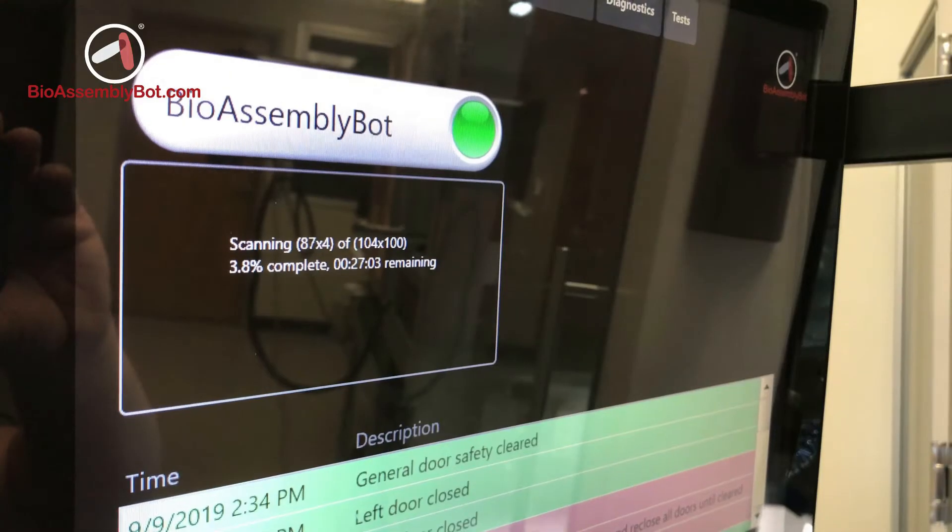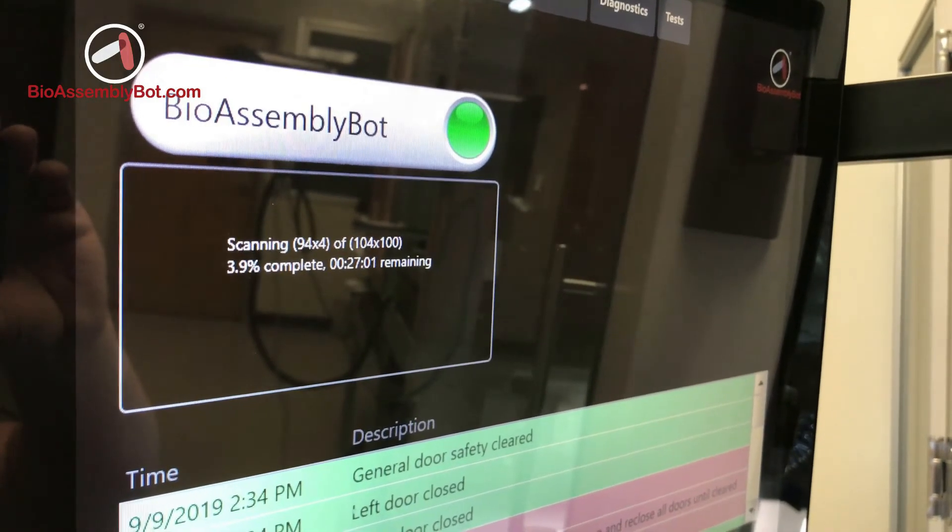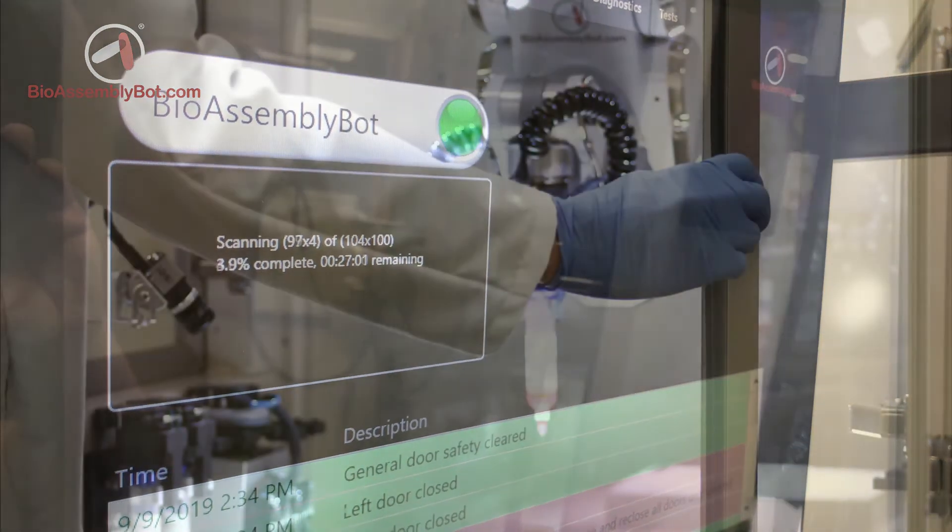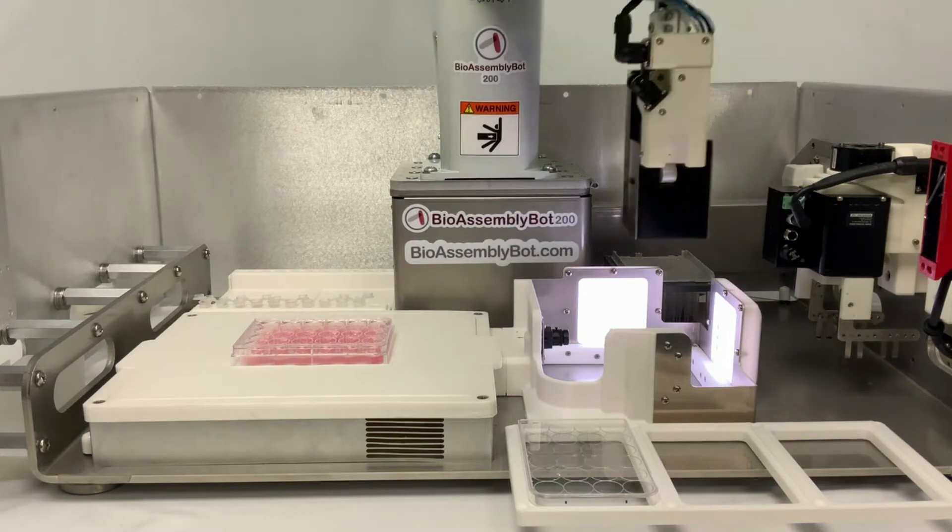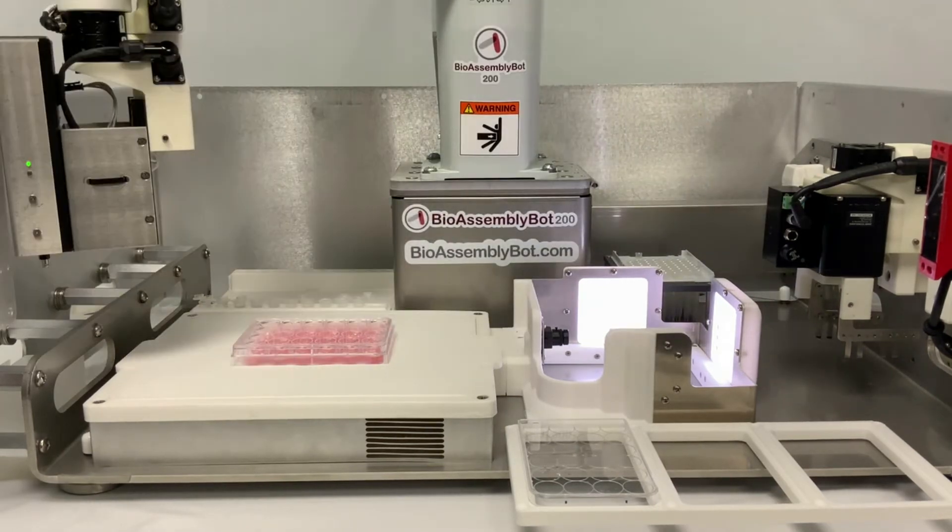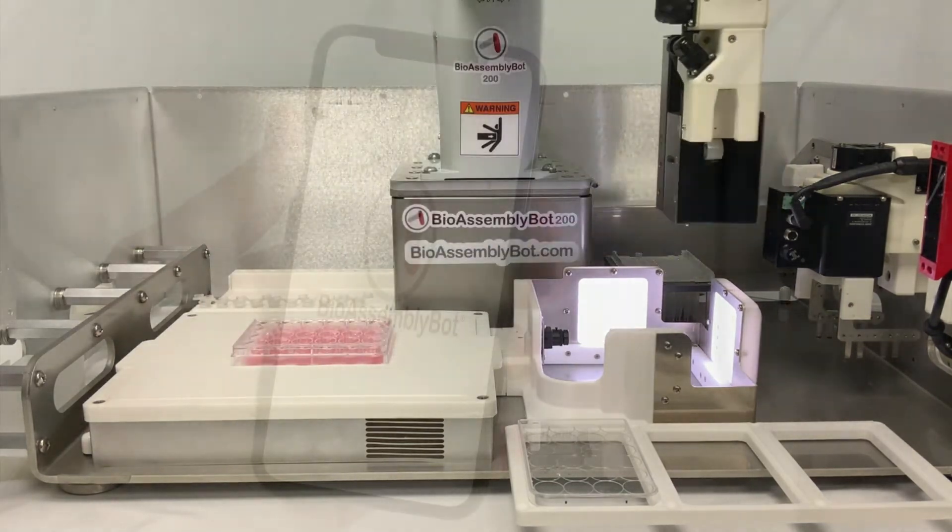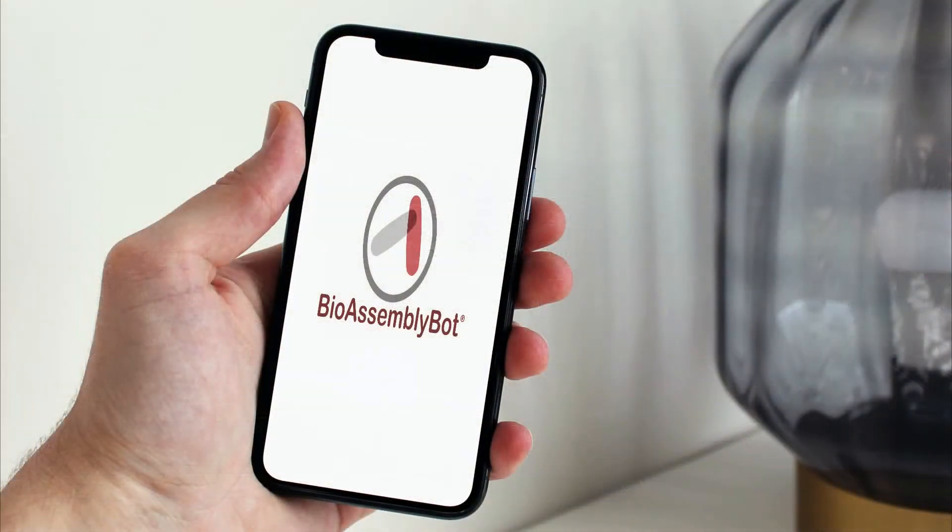From the BAB touch screen, you select your BioApp of interest, load the raw materials, and touch go. BAB will take care of the rest and can even notify you by text when specific steps in your biology recipe are complete.